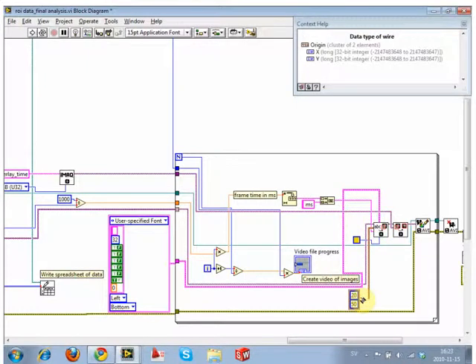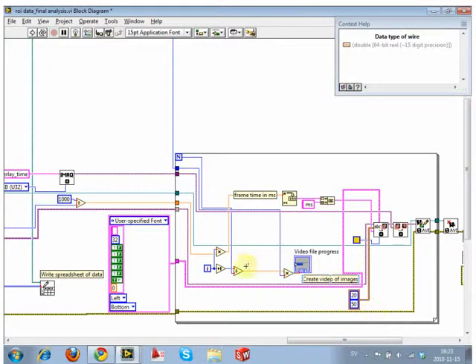So using the image size will allow you to set it, but the font specifics make it a little bit trickier. When you're overlaying lines, for example, like scale bars, you can figure out the image size and then calculate how long to draw this scale bar based on the image size, so that you know that the width of your image in the videos you've taken equates to 50 microns. Then it'll recalculate how big 50 microns is depending on your image size. That is a good use for that function.